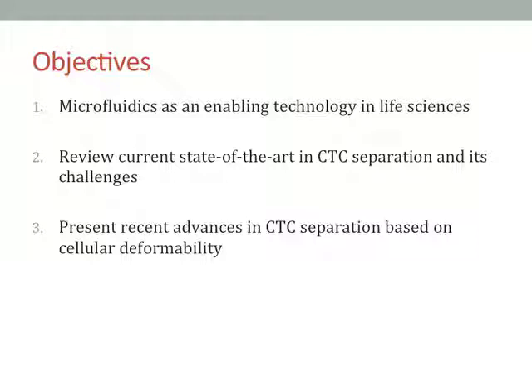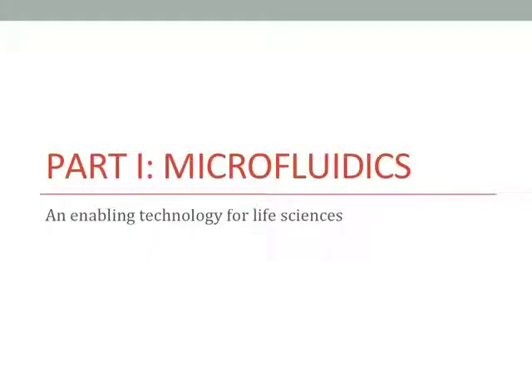Okay. So the first part is microfluidics. This technology has gotten a lot of attention lately, especially in the life sciences. So I just want to give you a background on it, a sense of what it can do and what it cannot do.